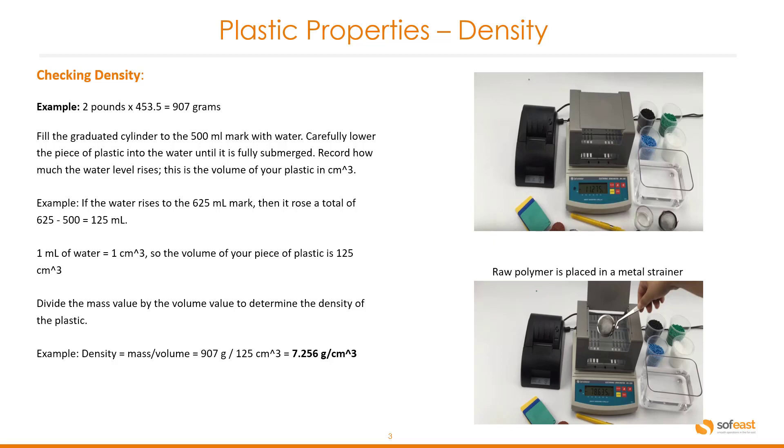The first step is to fill the graduated cylinder to the 500 milliliter mark with water. Carefully lower the piece of plastic into the water until it is fully submerged. Next, record how much the water level rises — this is the volume of your plastic in cubic centimeters.